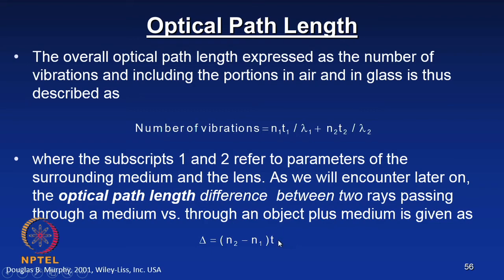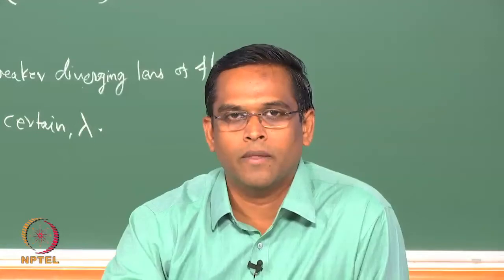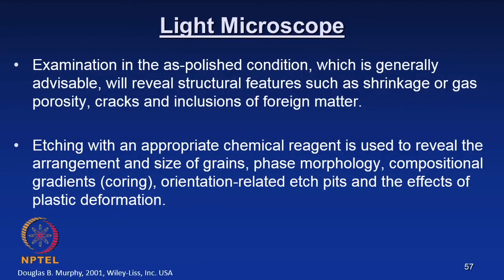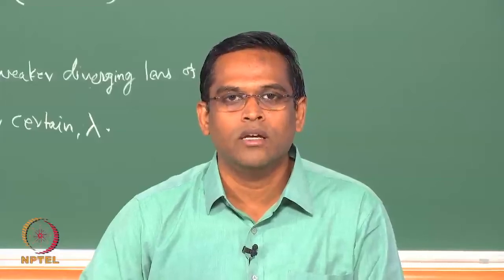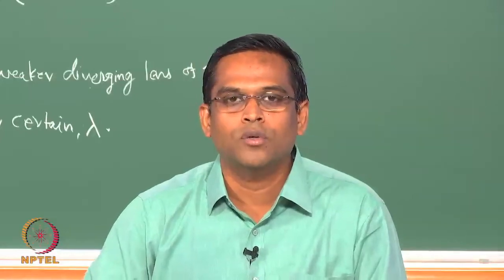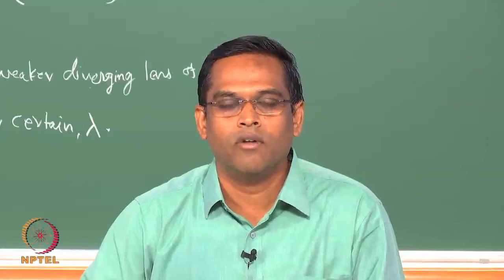So, as I mentioned, we will be using this parameter in one of the variants of the optical microscope, which I will be discussing. That is why I have introduced this concept. We will now see the general description of the light microscope. If you look at all the three classes, I have taken some of the fundamental concepts which you require to understand before we get into the use of this light optical microscope. I hope it will be useful in order to understand the functions of different variants of optical microscopes.